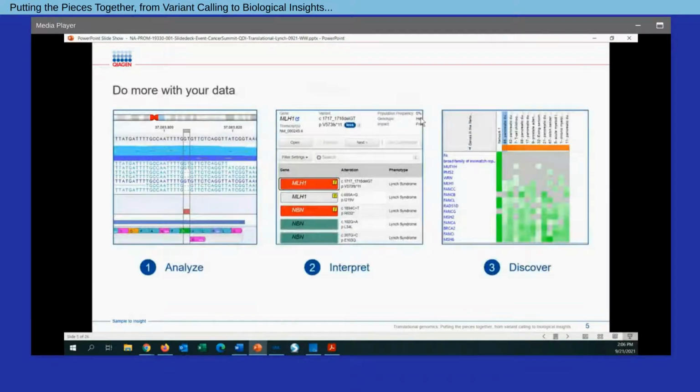To do these three steps, we're going to utilize three of Qiagen's software products. One is for analysis, CLC Genomics Workbench. For interpretation, we're going to use Qiagen Clinical Insights Interpret Translational. And for discovery, we're going to utilize Ingenuity Pathway Analysis.